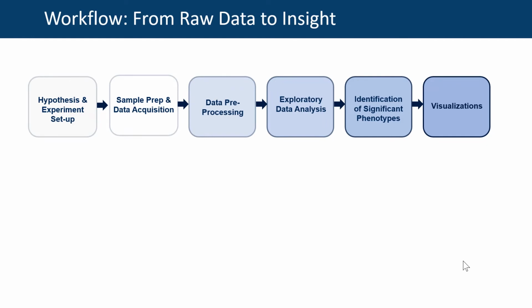So now we're going to talk a little bit about the workflow from raw data to insight. This is the step process that we have to follow. When we talk about running these algorithms, we need to make sure that we are still paying attention to the data pre-processing. All of the techniques that we're used to using in our data analysis still come into play when we talk about running these data visualizations. Junk in equals junk out. So the data pre-processing step is actually extremely important when we're talking about high dimensional data analysis.